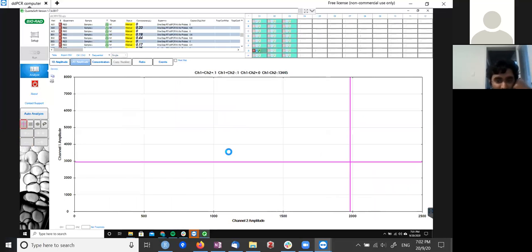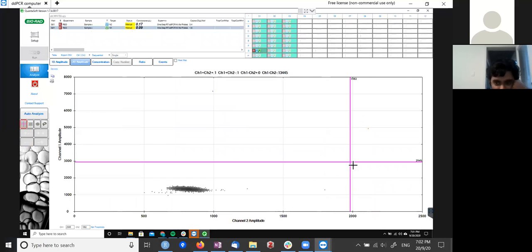Okay, we can just test it on G1 for now. G1 is mostly negative, it seems like. Here you observe the values 0.17 and 0.09, and then I'll change the threshold, and then we'll observe the values again. So change the value for N1. We made it 0.